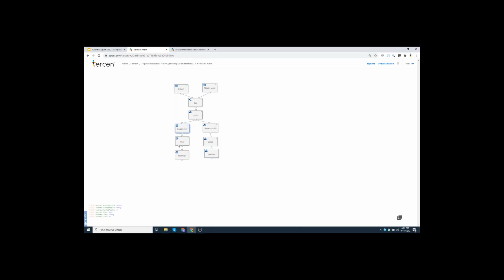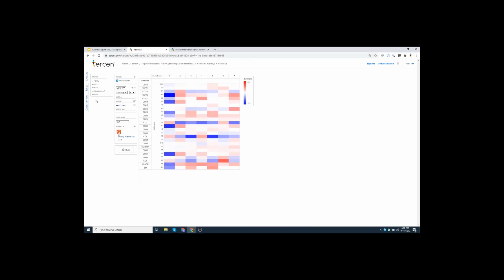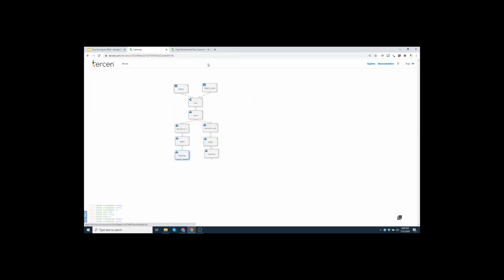That's what's nice about Tercen: you can take a different branch. I use FlowSOM at n equals 7. I use the MEM scoring from Kirsten Diggins' lab operator. And then I look at the heat map here. In the heat map now I have 7 columns, and I have the same number of channels, of course. If I do a Euclidean, I'll just log the values because it's easier to look at the colors. And you don't see the blocking effect. Well, you could argue that these two are blocks, but I would argue that this CD123 looks very different between them. So you have now used the MEM scores to appraise how many clusters to use in this case.